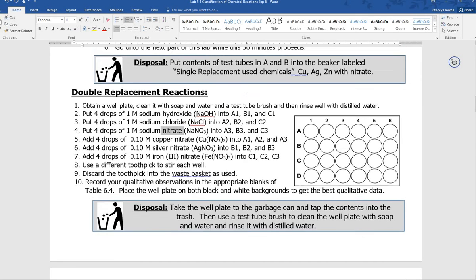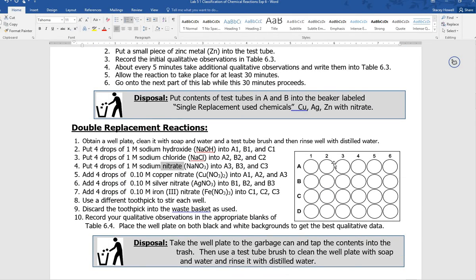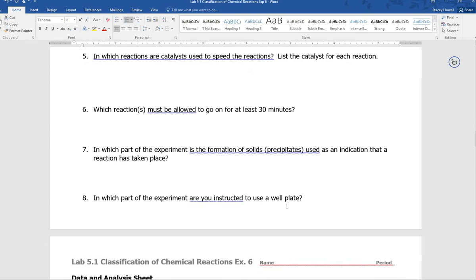Okay, on these two right here, when you're done with them, there is a waste container by the printer. So you'll put these in a waste container by the printer. On the double replacement reactions, when you're done with these, you're going to dump it into the garbage can and then clean it out with soap and water and a test tube brush. On these ones right here, you only have 4 that are going to make a solid. So you need to make sure you decide which 4 are actually solids. That's really important because they struggled with that last period. Okay? Yeah, it is. So you should have this pre-lab done.